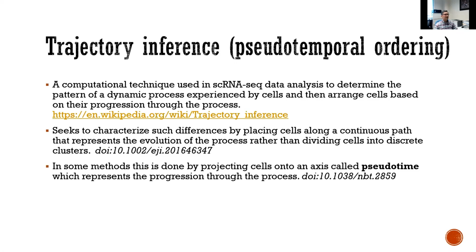So the methodology we are going to use is called trajectory inference or trajectory analysis to infer this so-called pseudo-temporal ordering system. So pseudo is not real, and temporal is time related. So you want to build a pseudo-time trajectory. This is a computational methodology, and using single-cell RNA-seq data, you can achieve this.